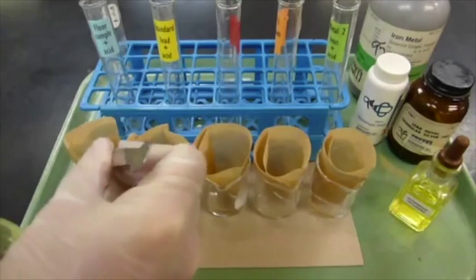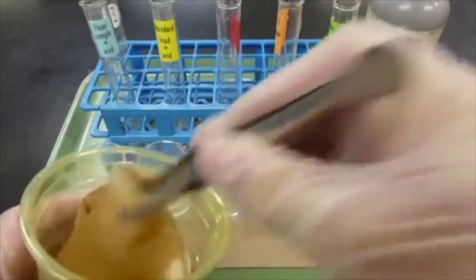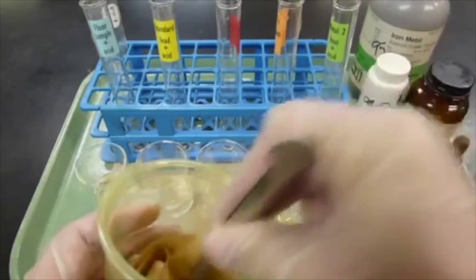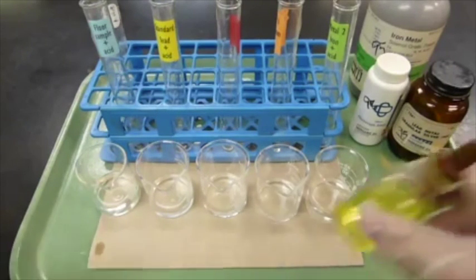So let me take out the filters here, and then I'll add the chromate, and we'll see if there's a reaction or not. You should already have predictions made for each one of these samples, and then we'll record our observations below the predictions to see how they compare. Okay, adding the chromate.